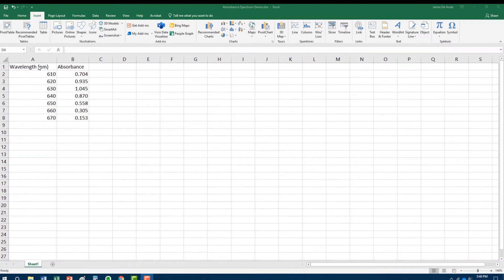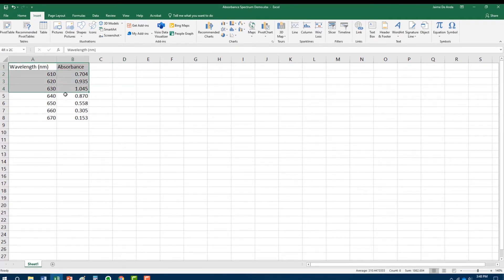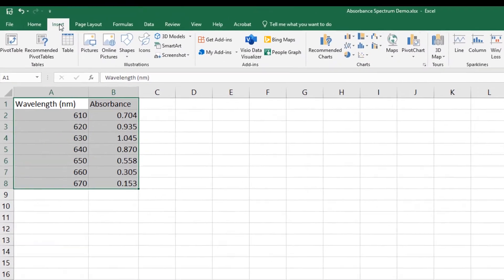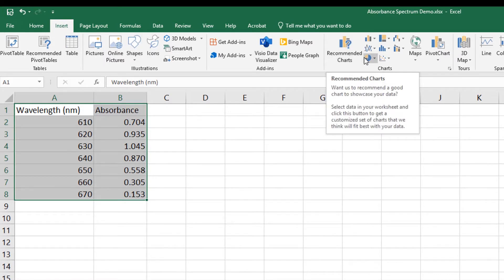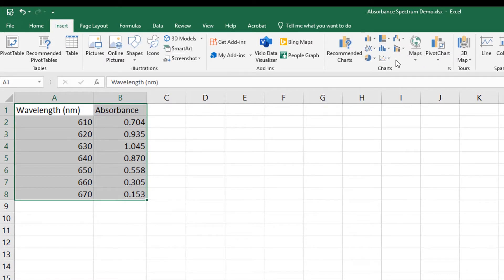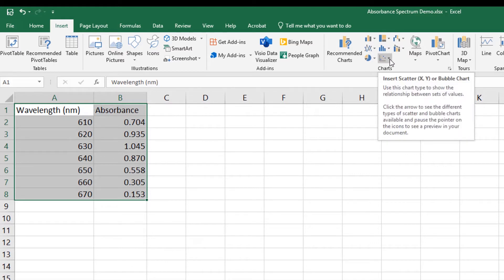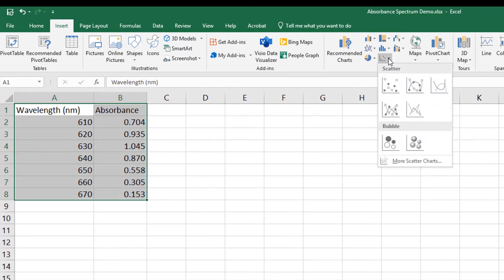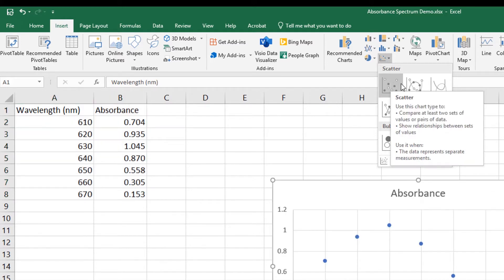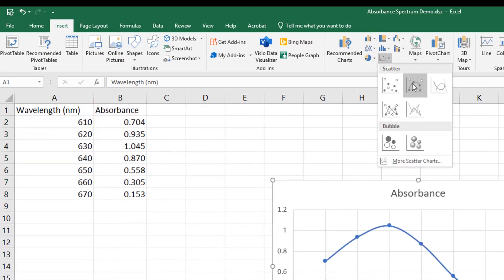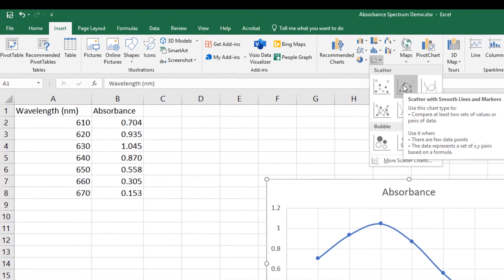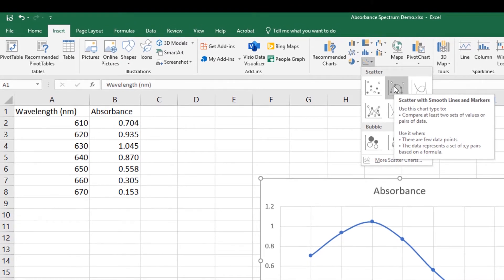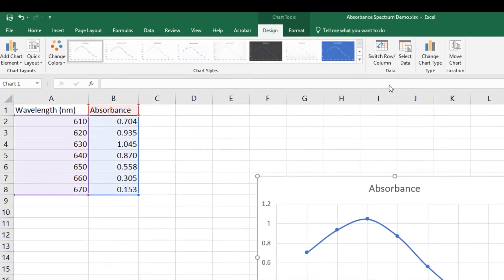What I'm going to do is start by selecting the two columns of data, and then I'm going to go up here to where it says Insert. I'm going to look for all the charts, and in the charts I'm going to look for the ones that have the scatter plots or scatter charts. There's a little arrow there to the side and I can click on it. I'm going to choose the scatter plot that says scatter with smooth lines and markers. As you can see, the program has already set up my graph.